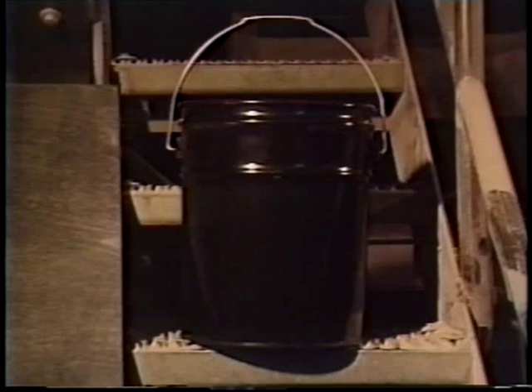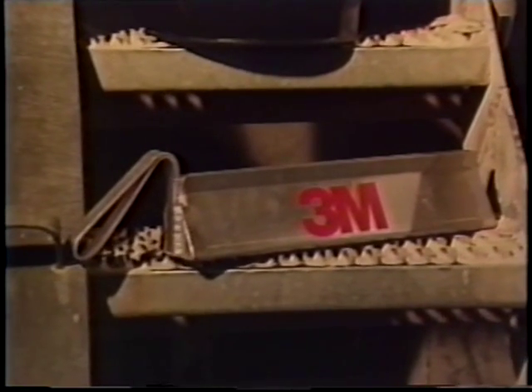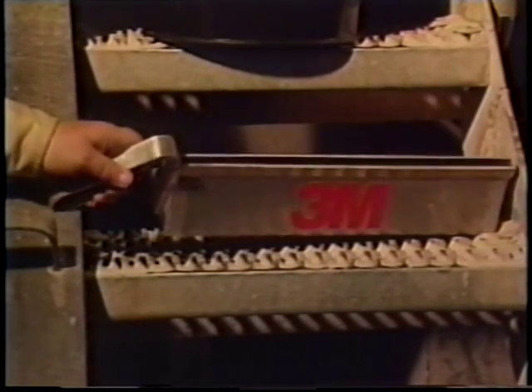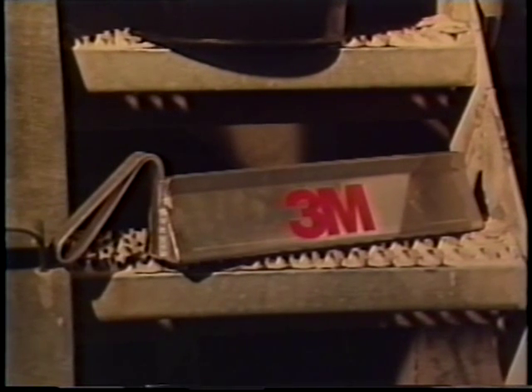To begin, you will need a good size bucket and a manual granule sampler like this one, or an automatic sampler. The sampler is designed to prevent overflowing and spillage, which can distort the quality of the sample.